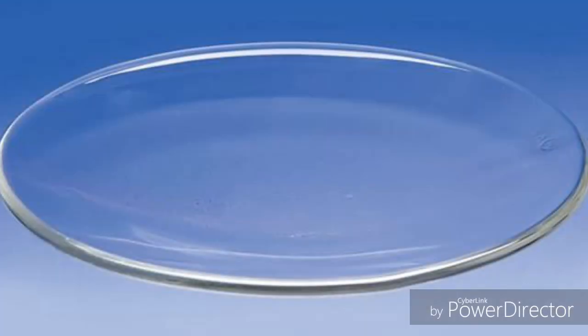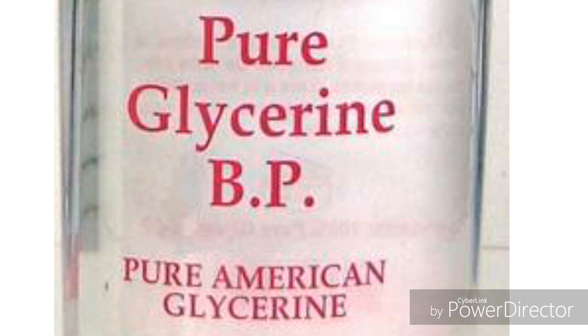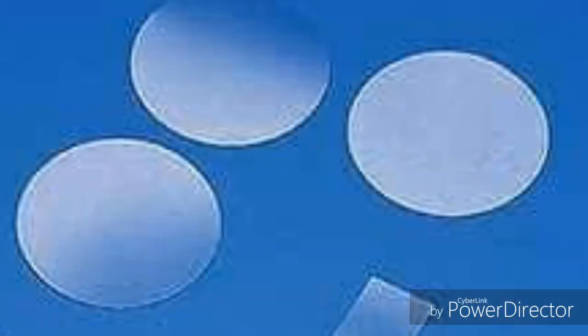Next, we have to take a glass slide, and on that glass slide we have to put a drop of water, and in that we keep the small piece of tissue which we collected from the mouth. With the help of a dropper we put 2 or 3 drops of glycerin so that the specimen which we want to observe will not dry up. On this specimen we keep one cover slip and gently press on it, taking care that no bubbles form.